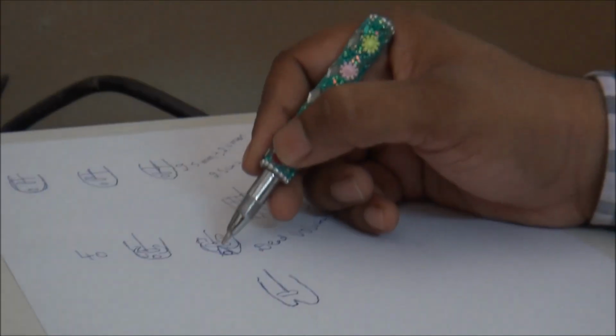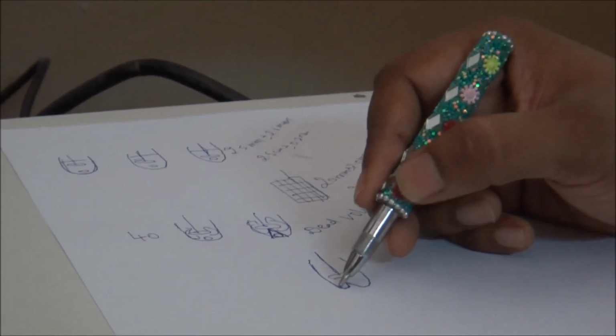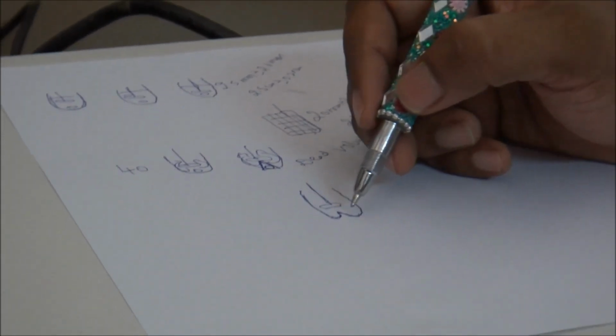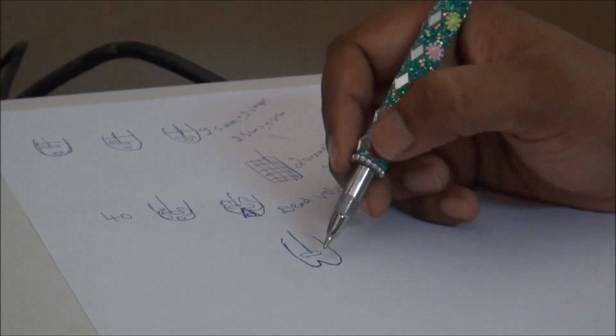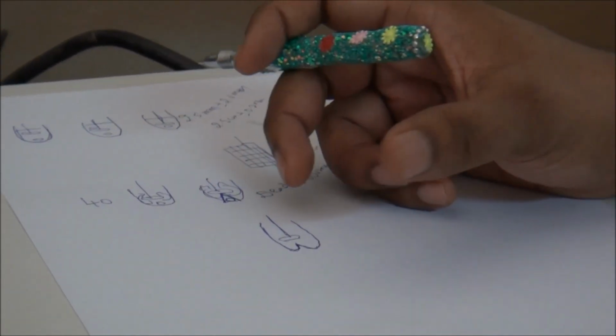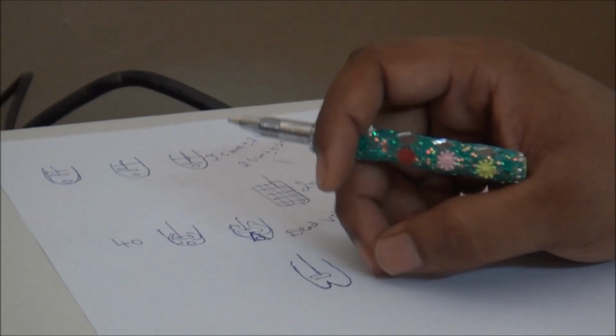This particular formation of a cone is also called the coning effect. Having this USP peak vessel is going to reduce the coning effect. Due to the presence of the peak, it has more height. So you have to select 40 mm depth when you are using a peak vessel, but not generally with official vessels.